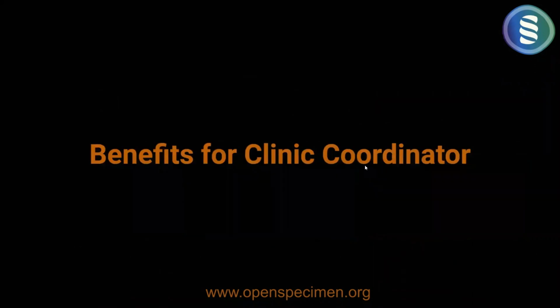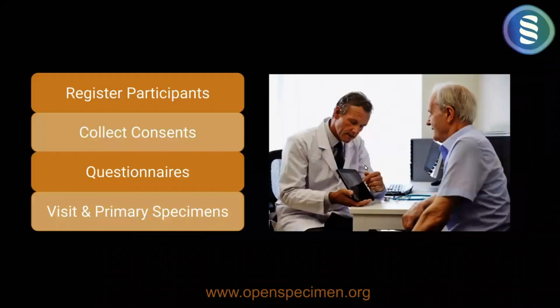So let's talk about clinic coordinators. These are the people who are in the clinic, and the typical use cases are registering new patients, collecting consents, or it could be questionnaires like medical history, smoking history, etc., or surveys that you have configured using our forms module.